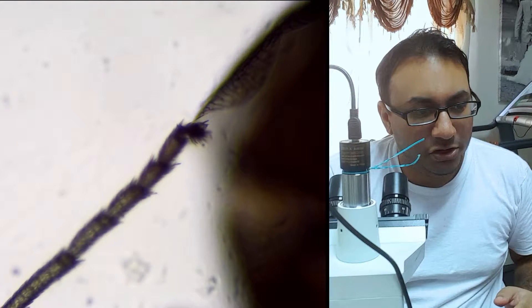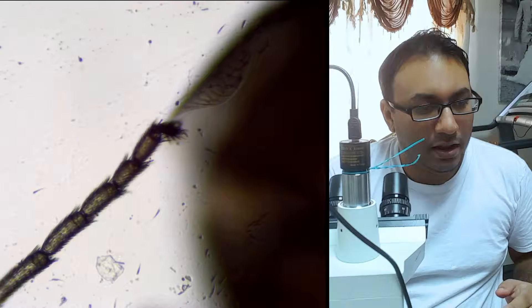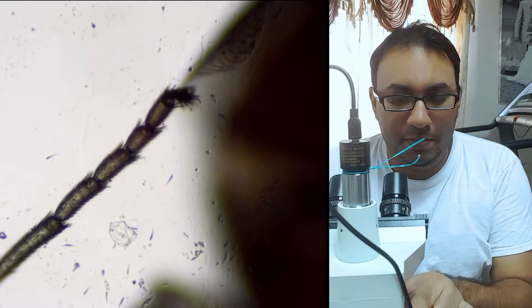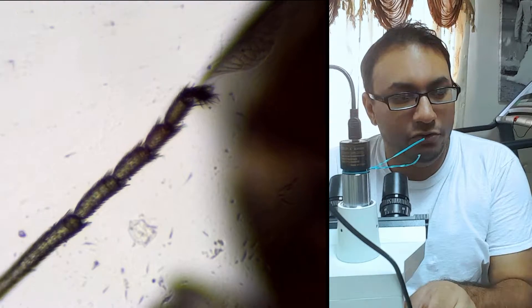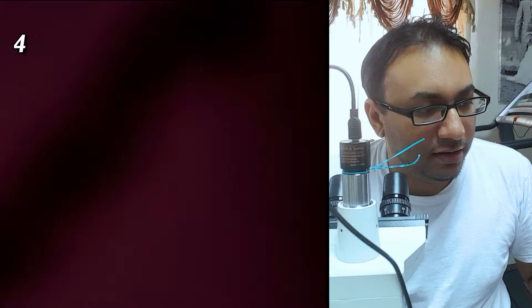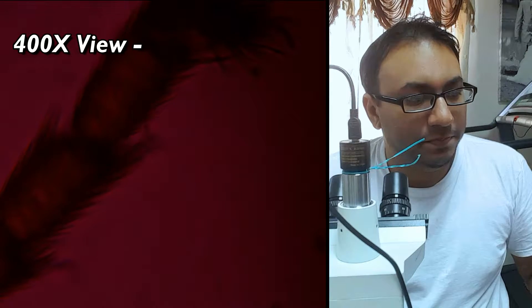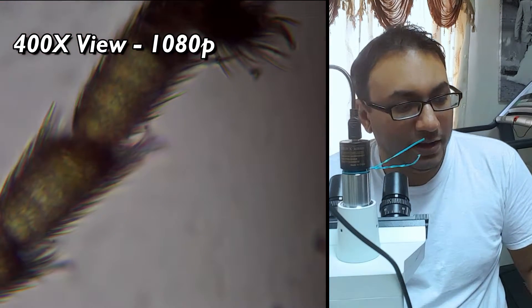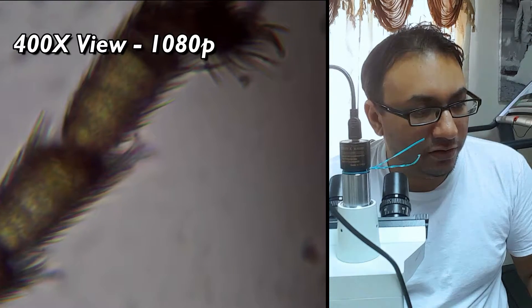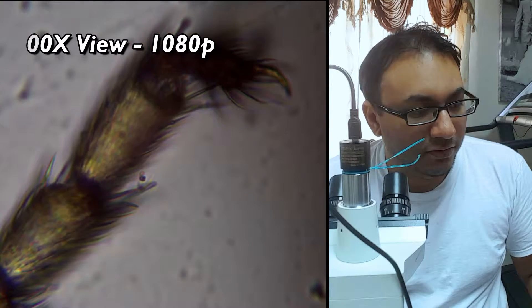What I'm going to show you right now is the ant leg, and that is at 100X 1080p. As we go a little bit further down, if I try to go at 400X it will get darker — and you can see it has already gotten darker. I'm going to raise the light up to most of the LED lights. But yeah, you can clearly see the defined edges of the ant at 400X — that's actually the fur on the ant's leg. Pretty cool, right?